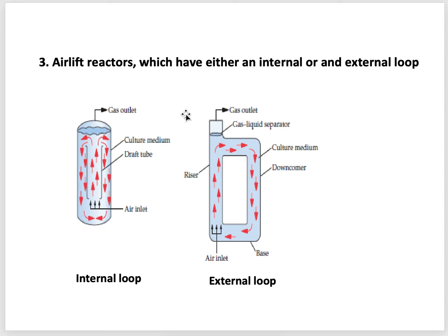Oxygen needs to be transferred from the bubble to the liquid. For doing that, the bubble should be inside the liquid, right? So the longer the bubble stays inside the liquid, the more oxygen will be transferred, right?